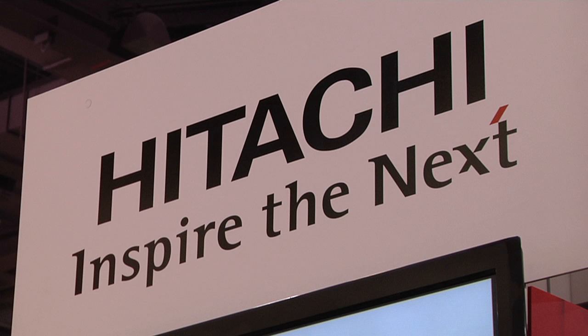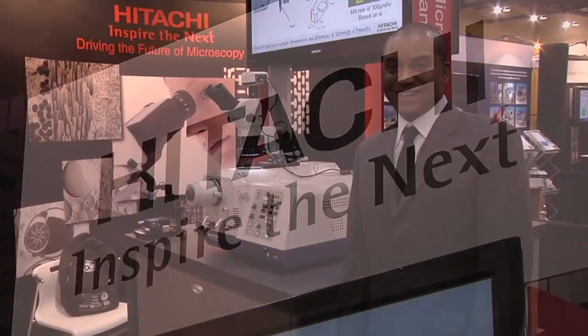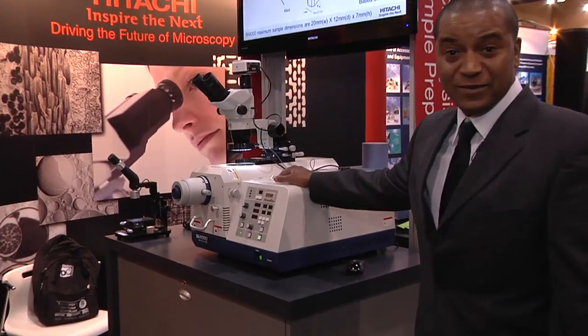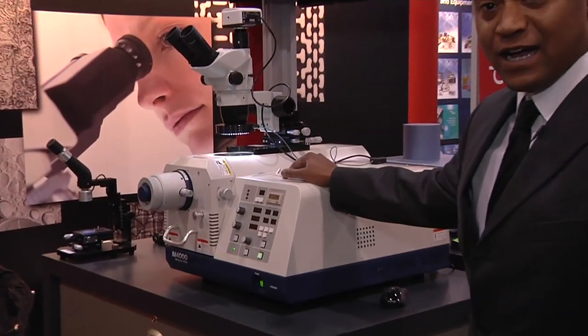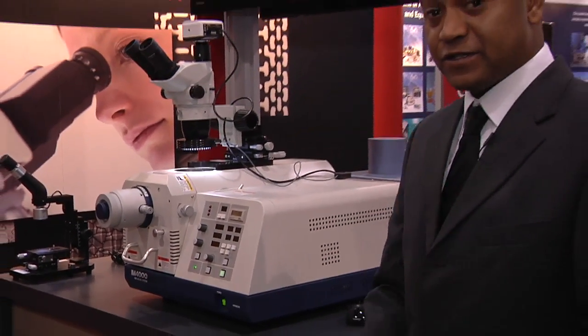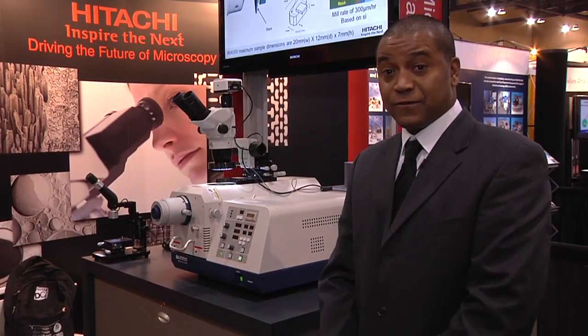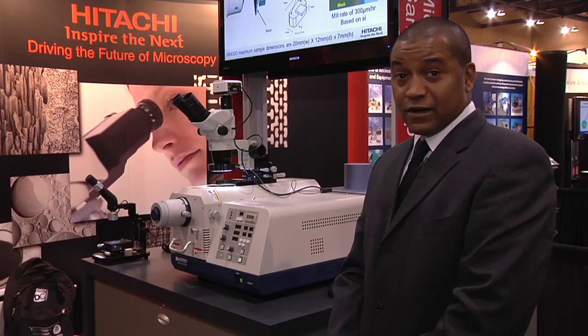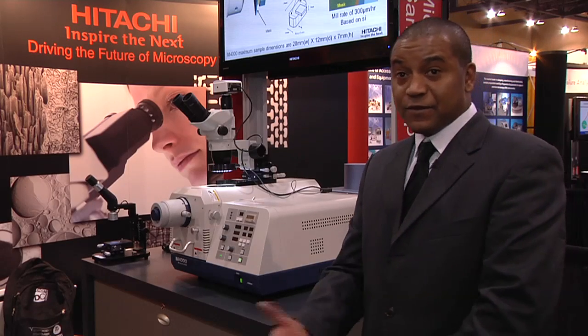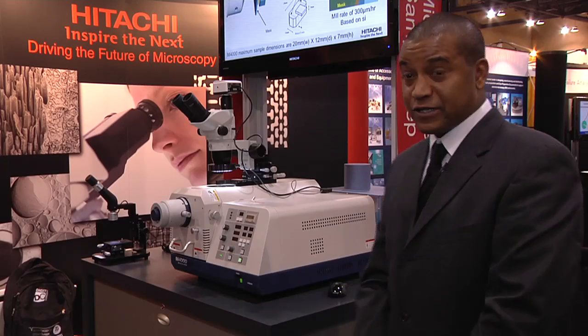This is ISVA 2012. My name is Jamil J. Clark with Hitachi High Technologies, and I'd like to highlight our product, the broad ion beam milling machine, the Hitachi IM4000. There are two significant key features for this tool: to perform cross-section milling and also flat milling. The argon ion beam used for this tool provides a damage-less type of observation when it comes to sample preparation.